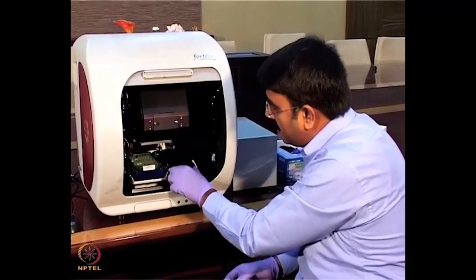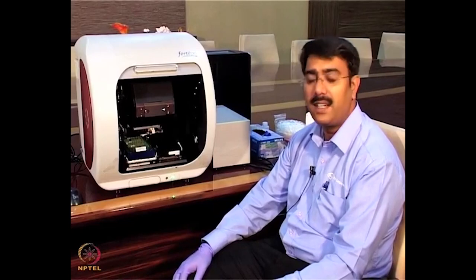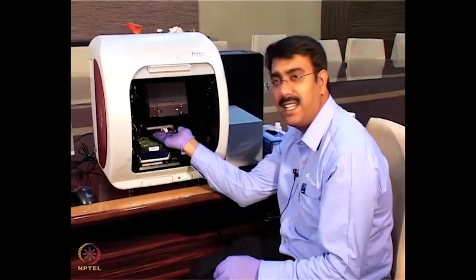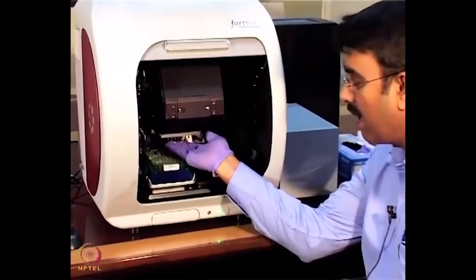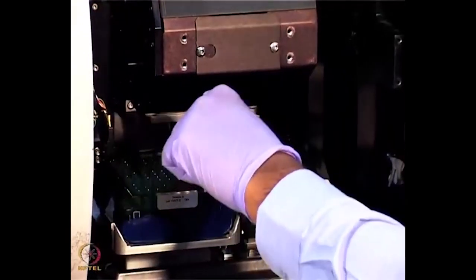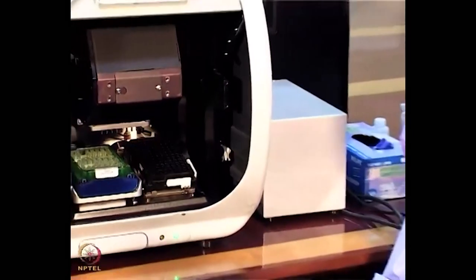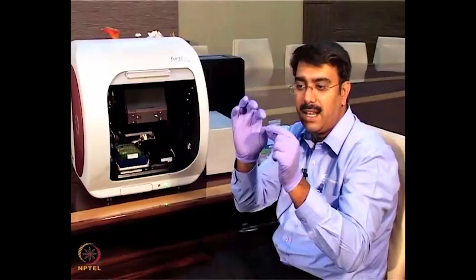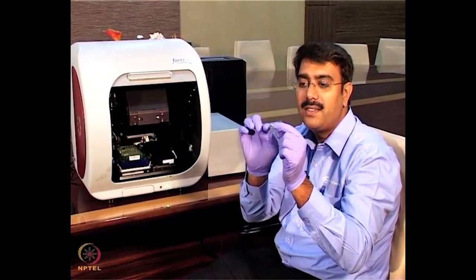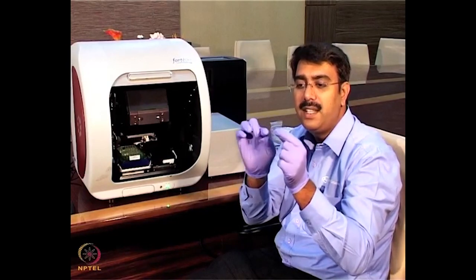This works on the principle of dip and read as well as Bio-Layer Interferometry. You know about the principle behind Bio-Layer Interferometry from the last talk. Here it consists of a white light. You can see here, this is the light emitting diode. We are passing the light from the light emitting diode through the sensor. This is the sensor. It is actually made of glass. It consists of a fiber optic inside, and the end at the holder part is made of plastic. So inside there is a fiber optic.